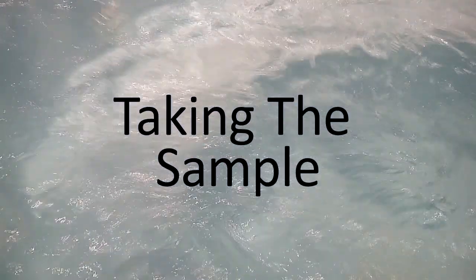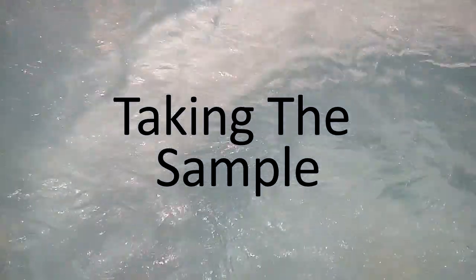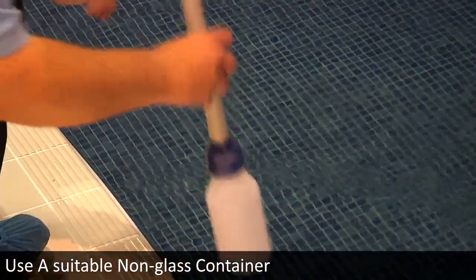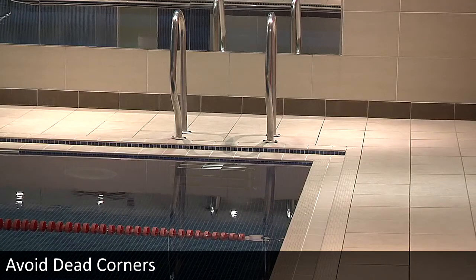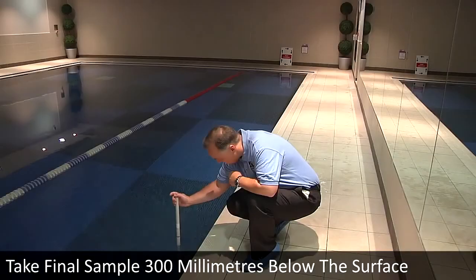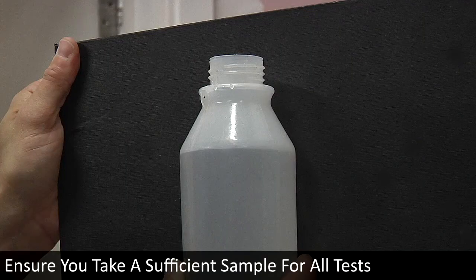We recommend the sample is taken from the pool itself rather than a sampling point. Use a suitable non-glass container, such as the Lovibond pool water sampler. Take the sample from an appropriate location, preferably midway between the inlet and outlet, and avoid dead corners. Rinse the container three or four times, then take the final sample from 300 millimetres below the surface. Always ensure you take sufficient sample to carry out all the tests.